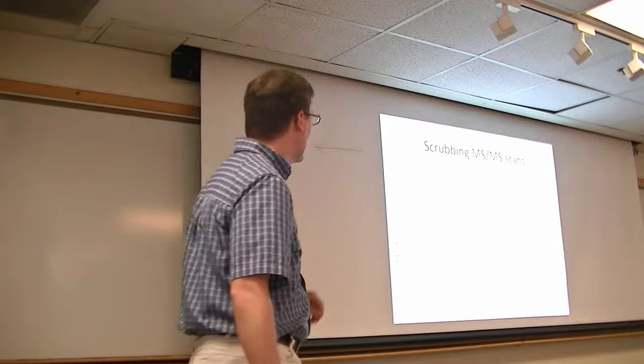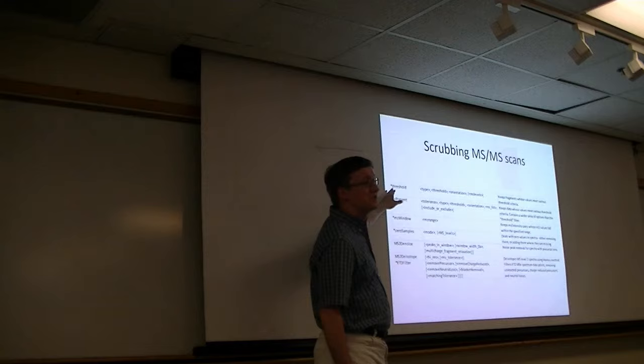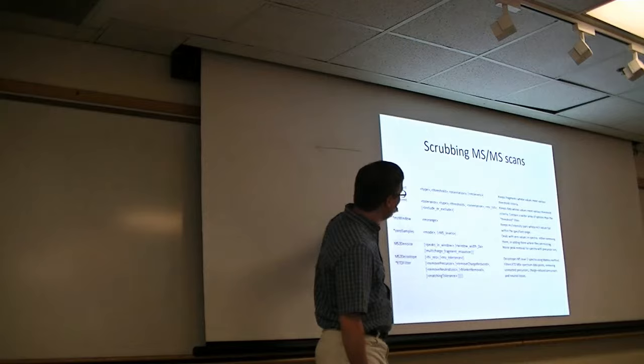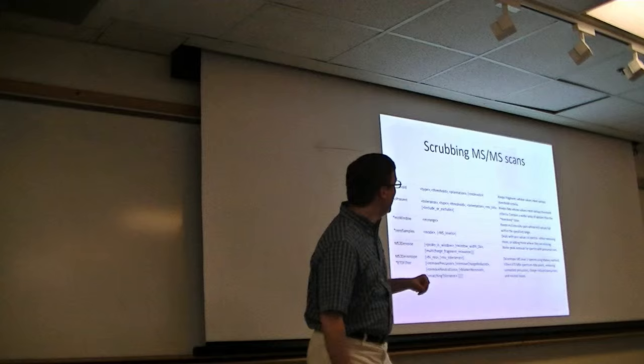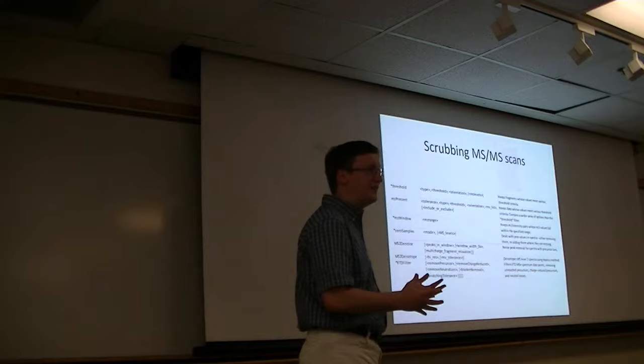Now we start getting into some dodgy stuff and I have to remember this as we go. So, bear with me. Thresholding. We want to do some cleanup within our spectrum. Maybe we want to keep just the top 100 peaks by intensity. Thresholding is one of the ways that allows us to do that. So, that is a possibility. Alright. The MZ present feature is kind of a curious one. We get to keep those data whose values meet particular thresholding criteria. So, we can force the software to say only spectra that contain a certain fragment ion, for example, will be included in the file. Well, I believe I am working through an example of that in the next slide. So, I am going to save it for the example. Alright.